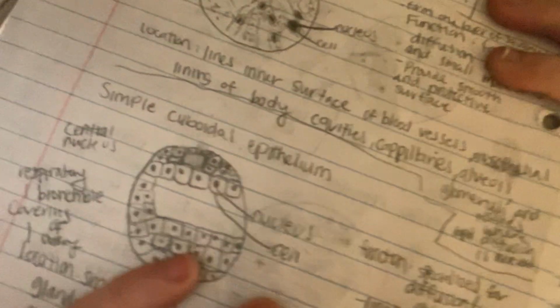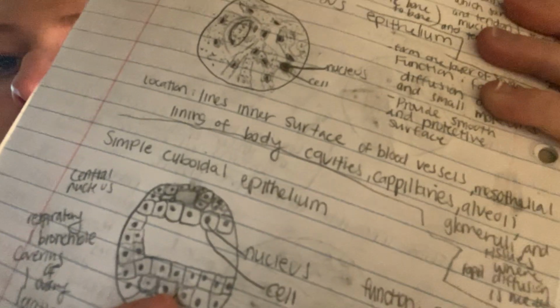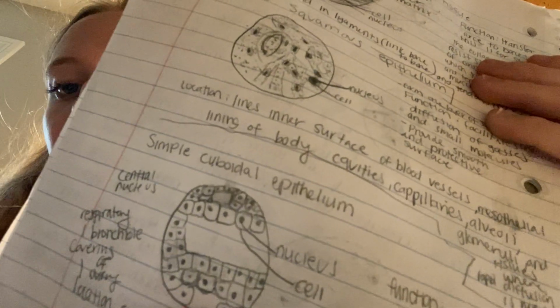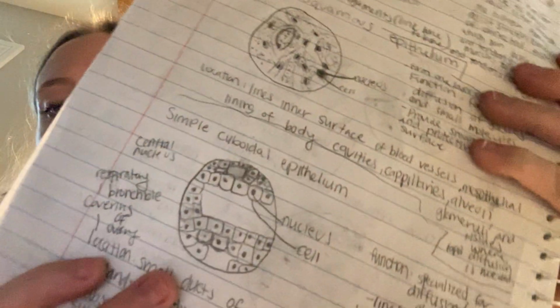And it has a central nucleus, so it's easy to identify through that. If you see a central nucleus in the epithelial cell, you can tell, especially by the shape, that that's a simple cuboidal epithelium. And it is in your respiratory bronchioles, the covering of your ovaries, and small ducts of kidneys, pancreas, and salivary glands, and in the kidney tubule cells, and it facilitates absorption and transport of filtered substances, and absorption and transport of many substances. So this is another look at that simple cuboidal epithelium.